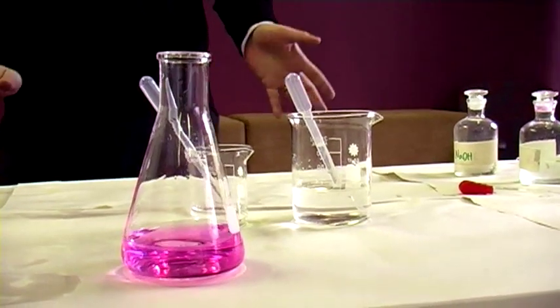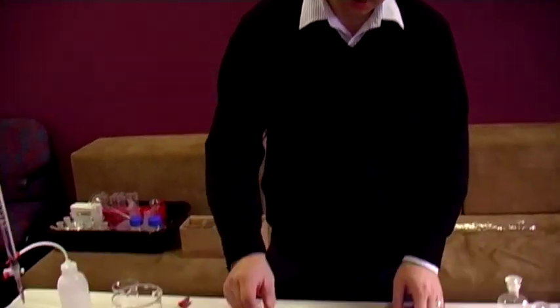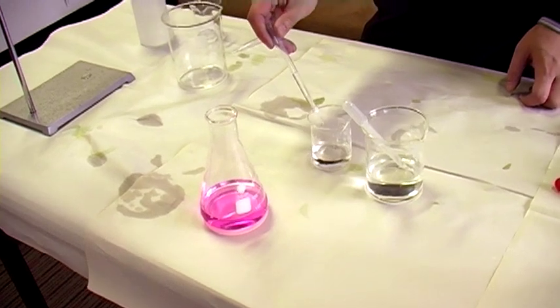So when doing a titration, it'll come down to one, two, or three drops. Just those last two or three drops should be enough to do a complete colour change. And that is where your end point is — that's where your equivalence point is, if you chose your indicator appropriately. Let me just show you one more.